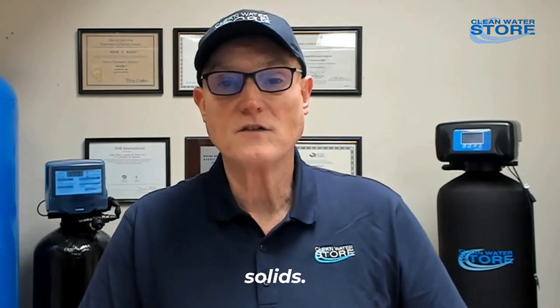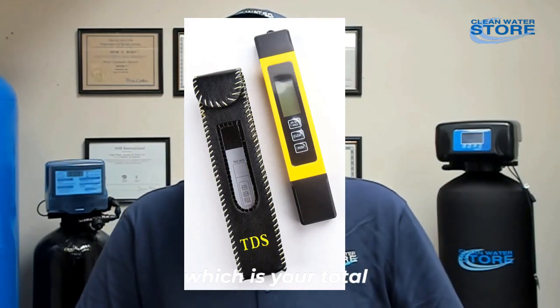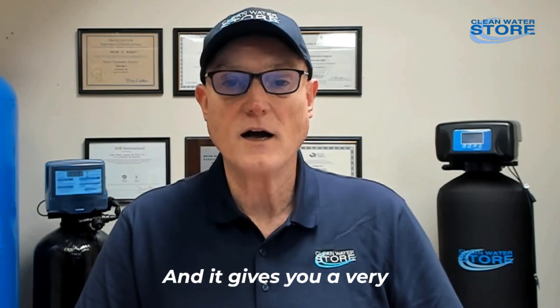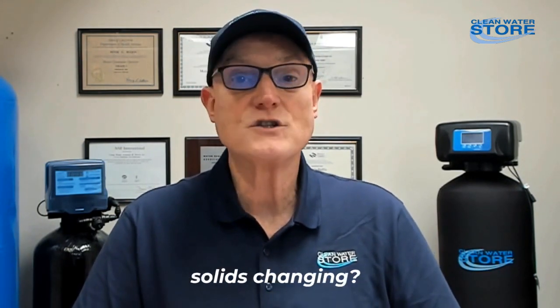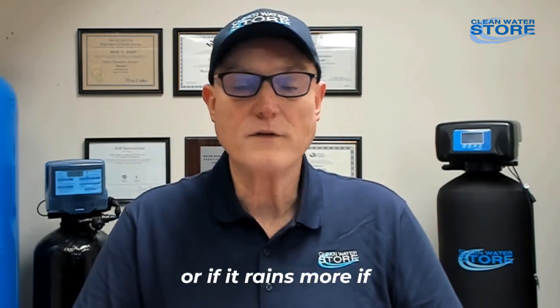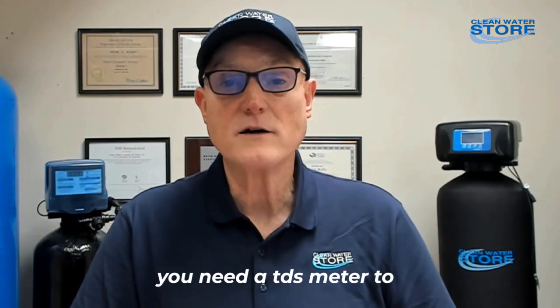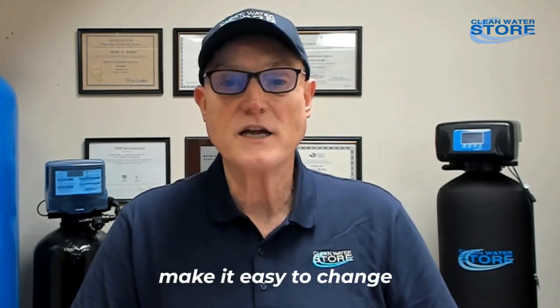Last but not least: total dissolved solids. These little meters are very convenient to use. They give you a close approximation of your total dissolved solids — the total amount of inorganic salts or minerals in the water. You can monitor your well water over years to see if the TDS is changing — maybe the water is getting saltier, or maybe it improves during the rainy season. Also, if you have an under-the-sink reverse osmosis system, you need a TDS meter to see how the RO is performing, and to know when it's time to change the membrane.